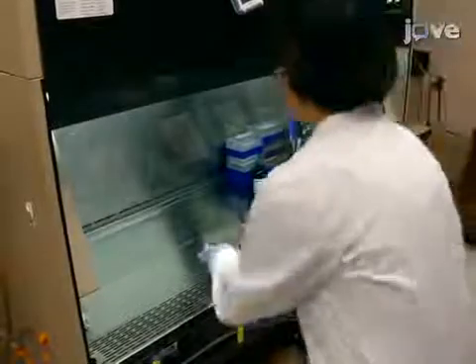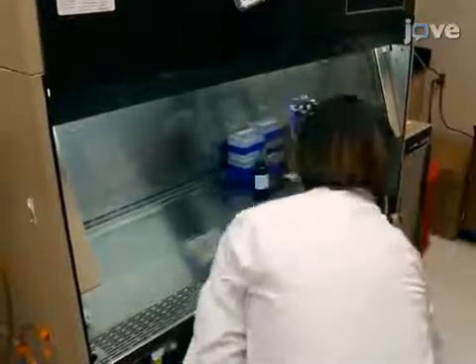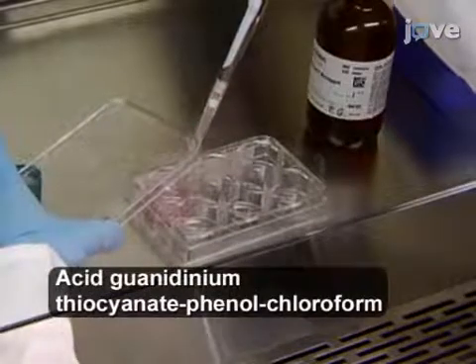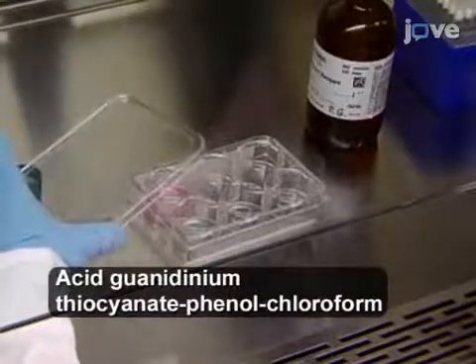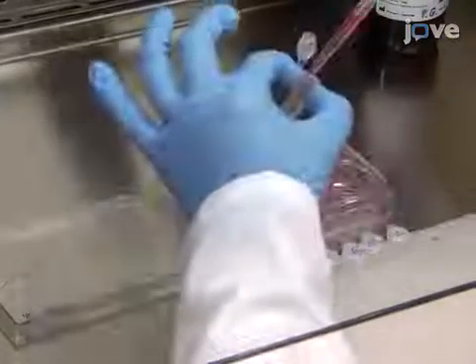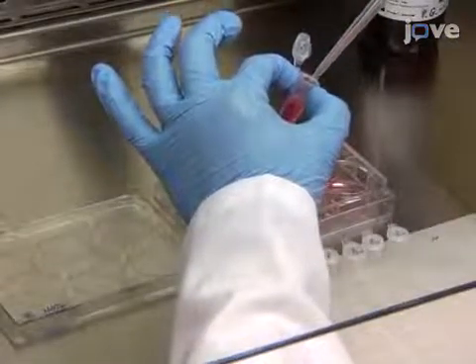After culturing MCF7 cells according to the text protocol, harvest the cells by adding 1 milliliter of RNA isolation reagent to each well and incubate at room temperature for 5 minutes. Use a pipette to collect the cell lysate and transfer it into 1.5 milliliter tubes.